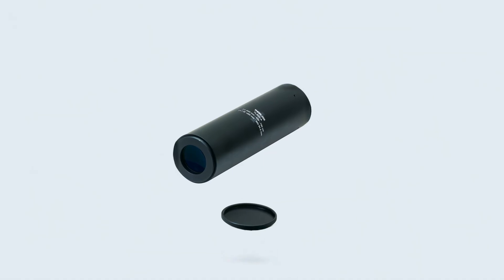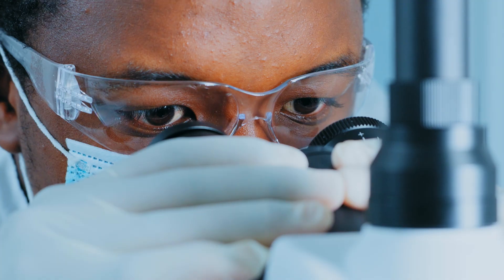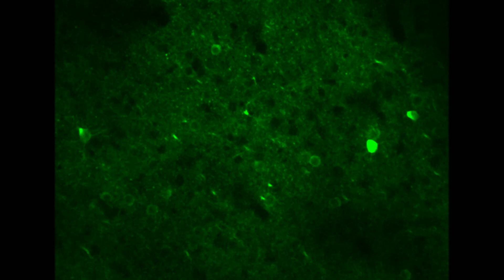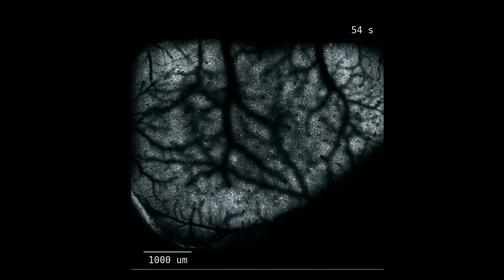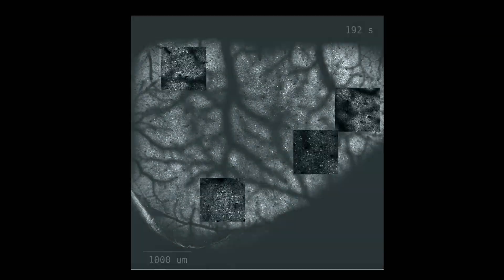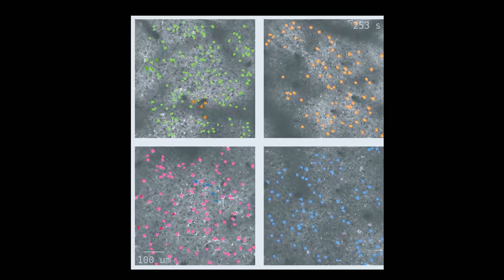I'm David Manzi, the design engineering manager at Thor Labs. In general, objectives, microscope objectives, and tube lenses are really targeted towards the multi-photon fluorescence microscopy market. That's a very demanding market — they require diffraction-limited lens systems that are verified, very wide fields of view, very wide color correction. That's a top-end market area, and that's really where we're targeting objectives and where we have the most to offer.